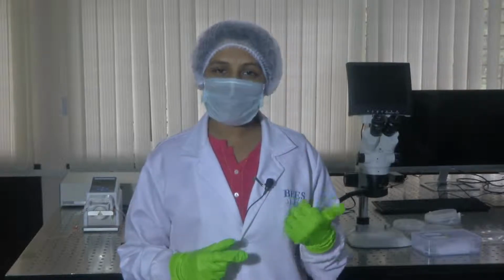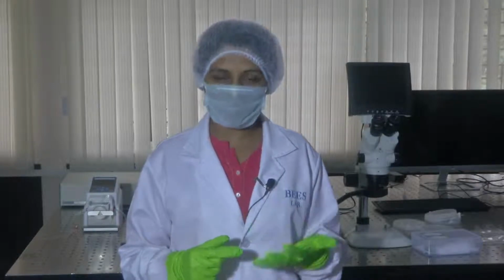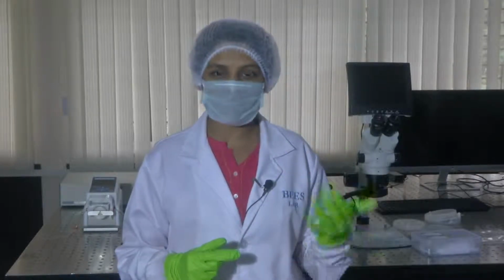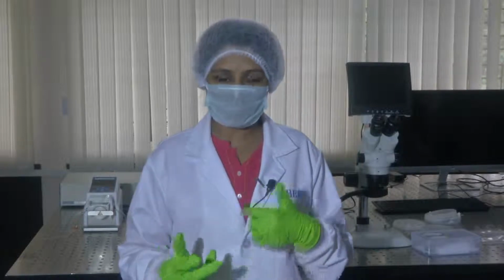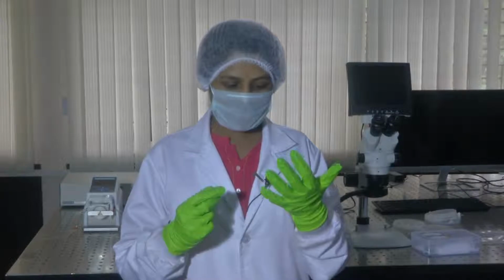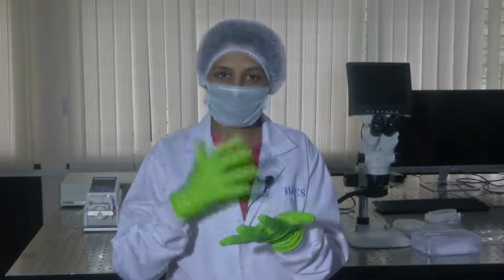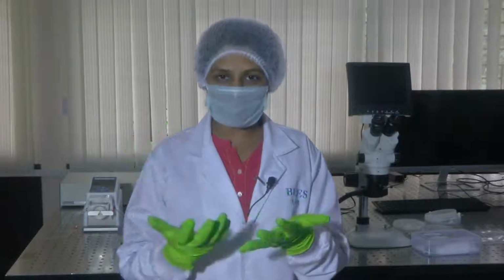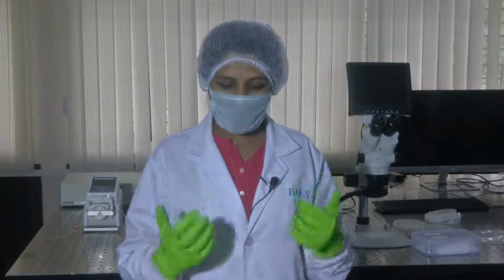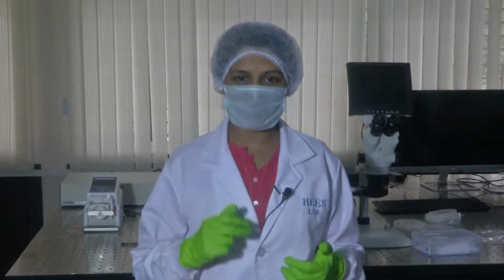As I've already mentioned, these biochips, also called microfluidic chips, or even termed lab on a chip, mimic the biological environment. They have multiple channels in them in order to replicate the biology, the physiology of the organ functionality. So, how do we control fluids in microchannels?